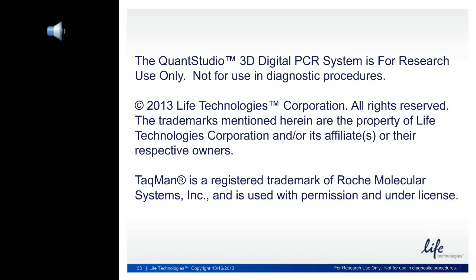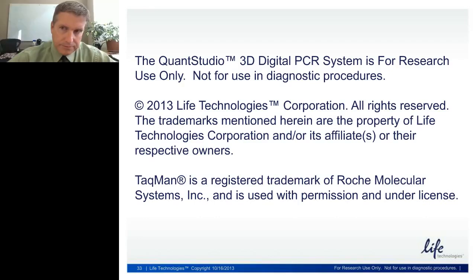The question is whether or not a molecular beacon type probe can be applied to this type of application. The answer is probably yes.